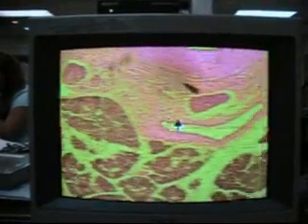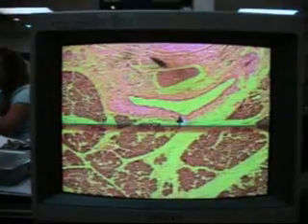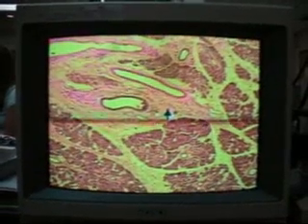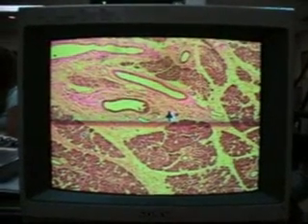You'll be able to see the various components of this artery. This is probably another little vein right here — you can see the lumen. Most of these vessels will be in the connective tissue areas. These darker areas here are the cell clusters that are going to be involved in secretion, but we don't have to look at those right now — we'll see those next week. Right now I just want you to see arteries and veins.